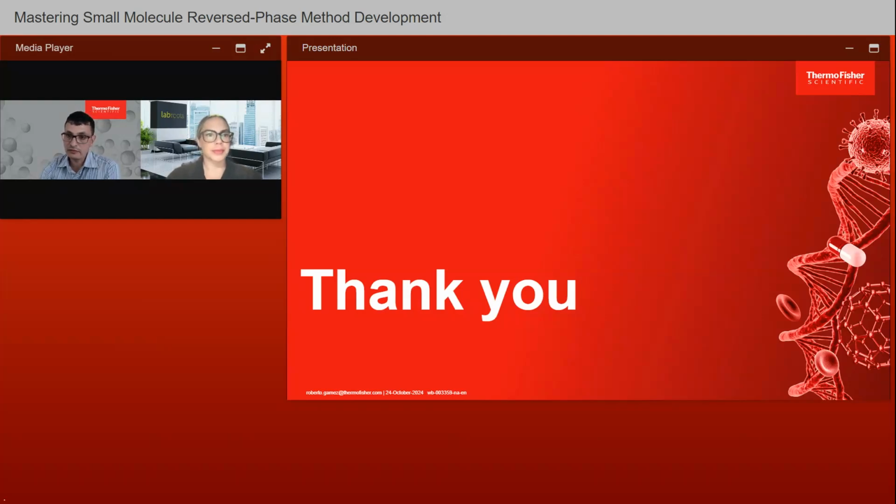pH, that's a good question. Again, this is one of the points we did not really touch on in these slides. Obviously, the pH is quite an important factor. It influences the ionization of the analyte of interest, which really affects the retention time and also the interactions with the stationary phase.